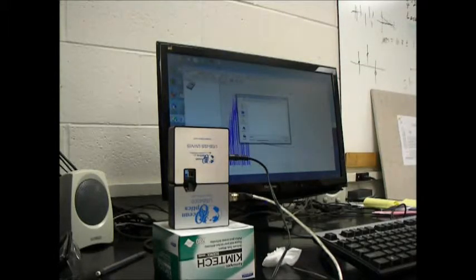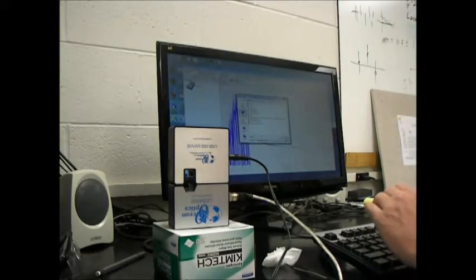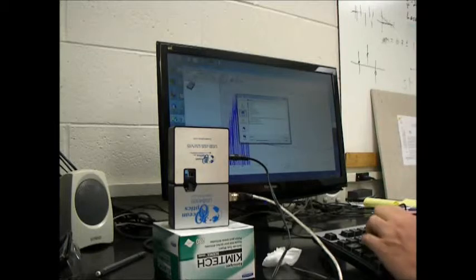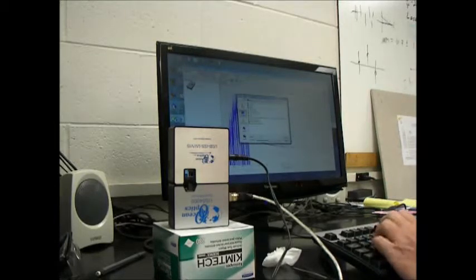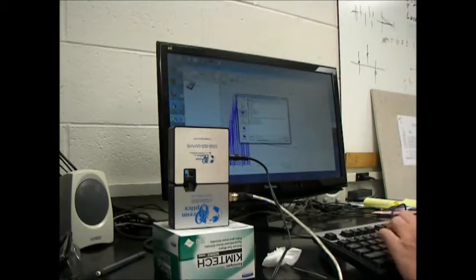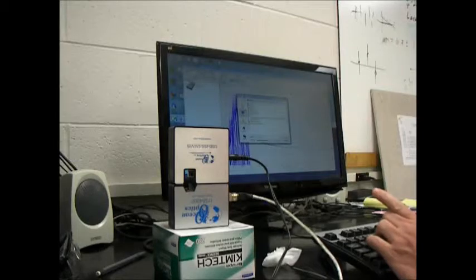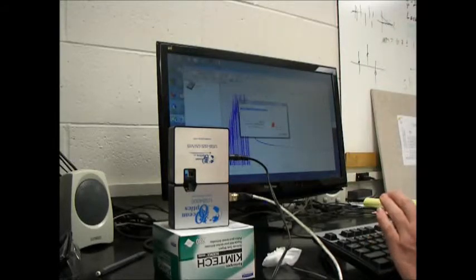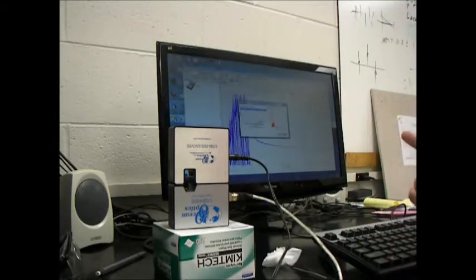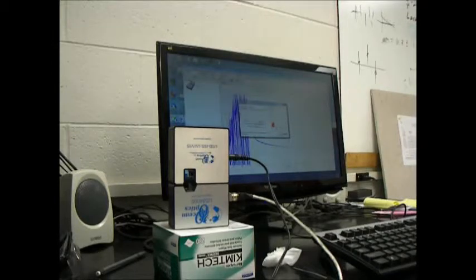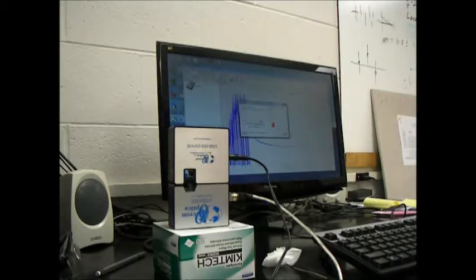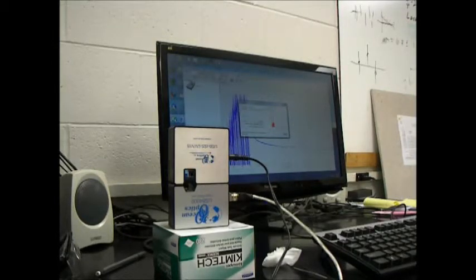Let's say I just wanted to save it on my desktop. Let's call this Test Sample 1. I click Save. Now you have to hit Save again. Now it's done. Let's go ahead and hit Close.